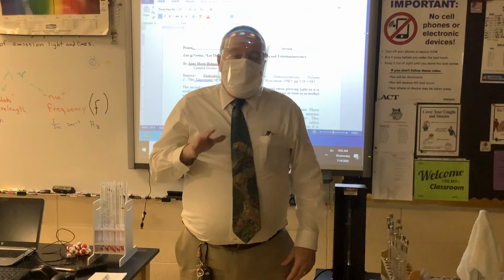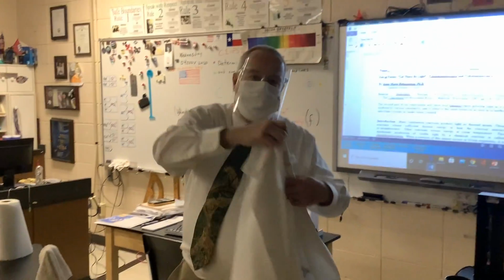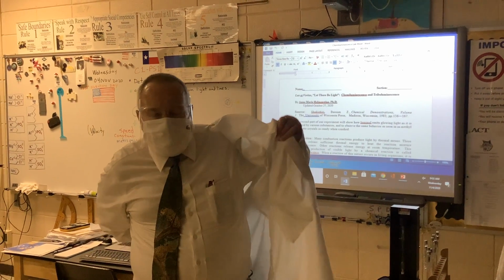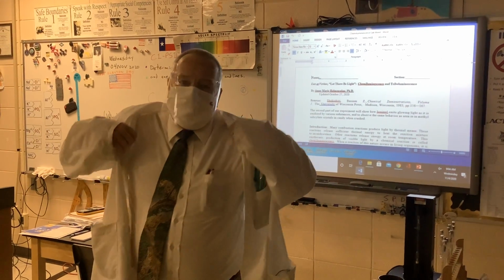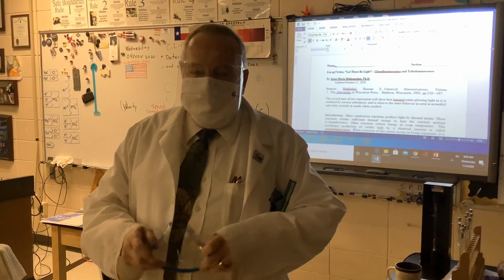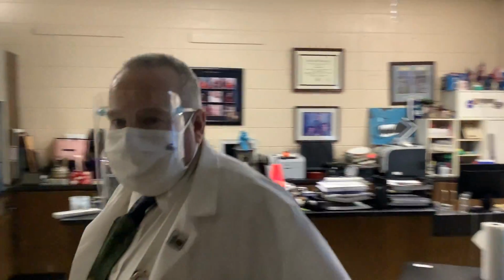That being said, we're going to look at chemiluminescence and glow sticks. So let's complete our laboratory instructions as outlined in the procedure here. We're going to take 3 commercially available chemical glow sticks, and we're going to investigate what affects them. So we're going to refer back to this when we start talking about chemical reactions, and also later when we start talking about rates of chemical reactions. I'm not going to put on my safety glasses because I'm wearing a face shield because of the COVID pandemic.